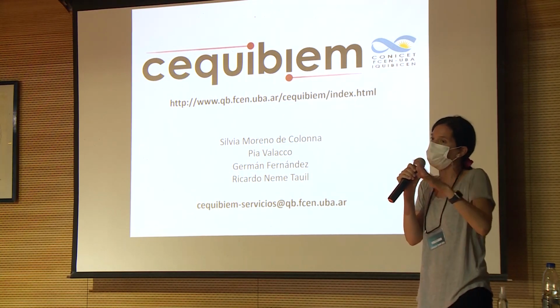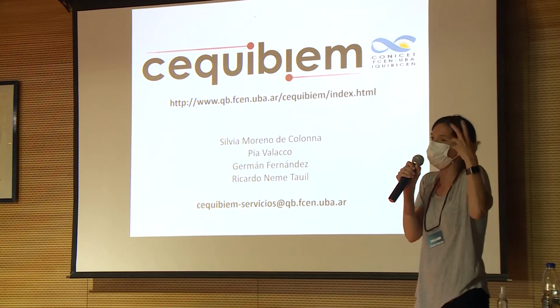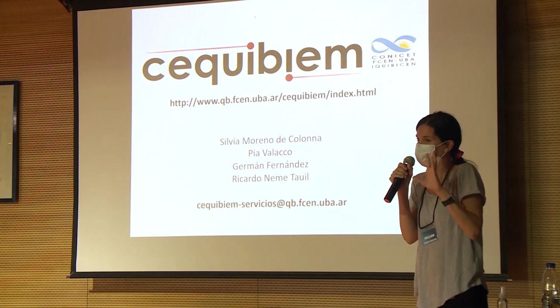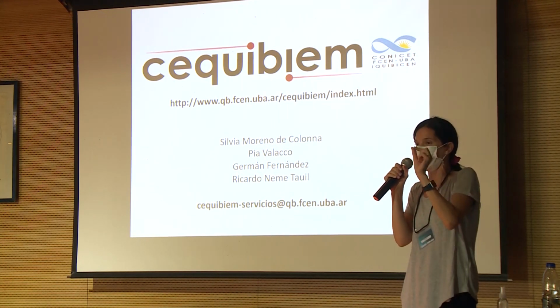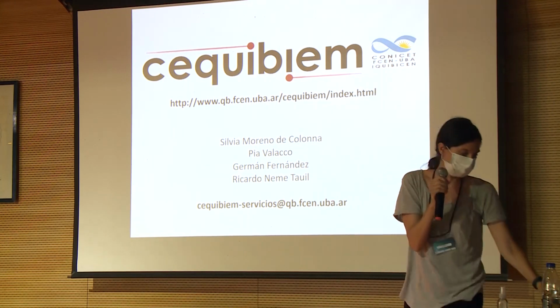Anyway, I'm not an expert in instruments and how they work. I understand the basics, but I don't really know the chemistry and the physics behind it. So I might not be fully understanding and answering the question. But I think you might have gotten confused when I talked about the triple quadrupole.